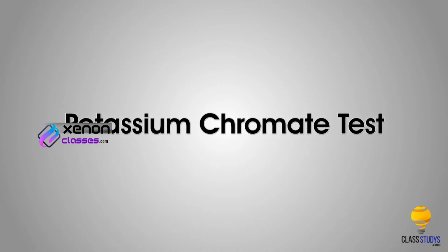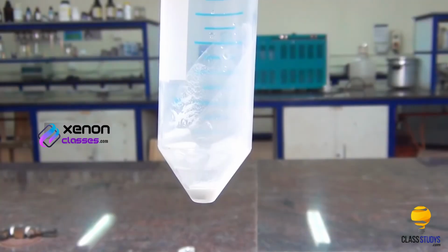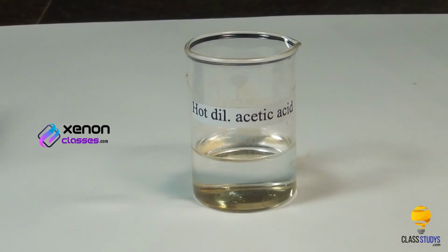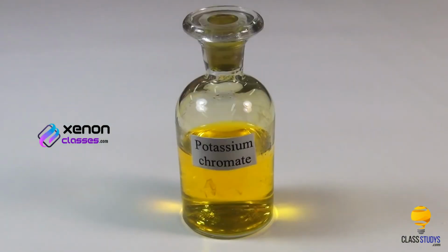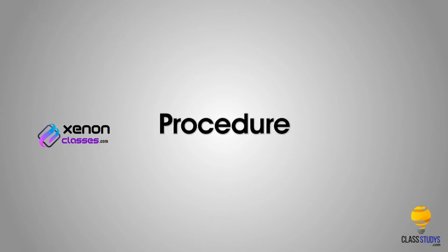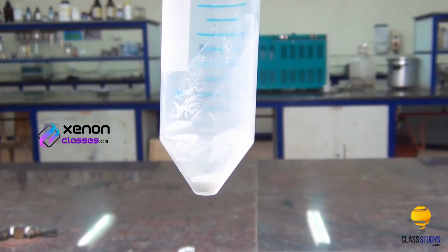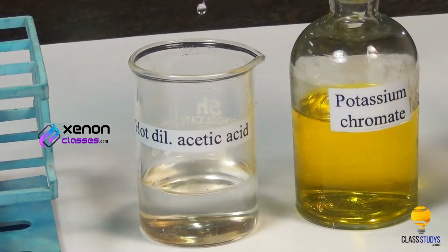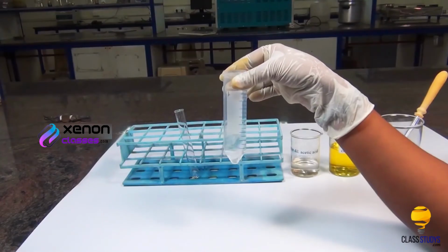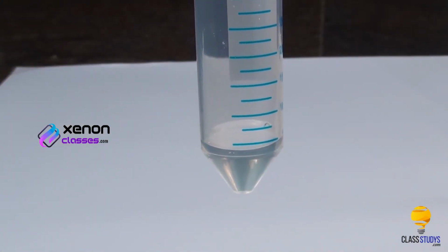Potassium chromate test. Materials required: precipitate obtained in the group analysis, hot dilute acetic acid, potassium chromate solution, and droppers. Procedure: take the precipitate obtained in the group analysis. To this, add a small quantity of hot dilute acetic acid using a dropper. Barium carbonate reacts with acetic acid to form soluble barium acetate.